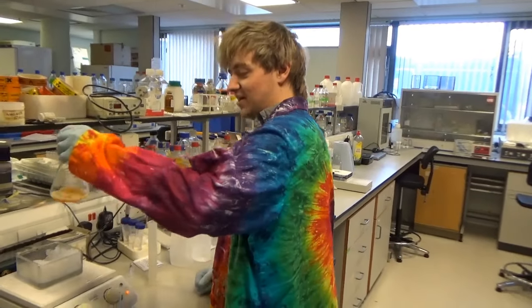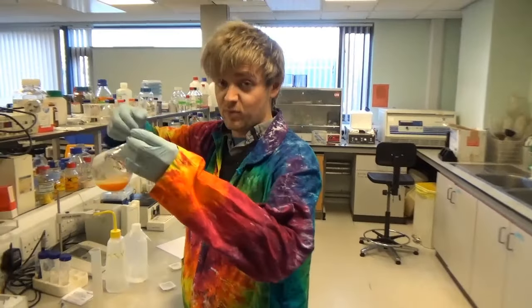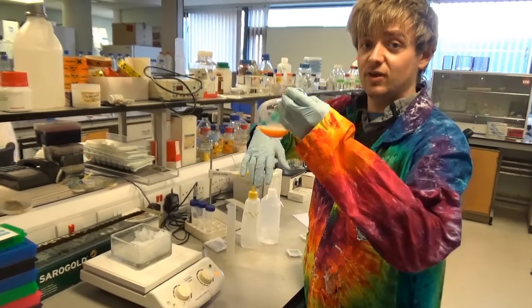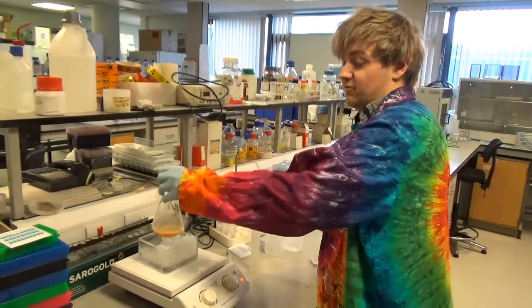All I do with this is I simply attach it with a pipette, same on my electrodes again, run an electric current through it, and that causes the molecules that are in here to stick to my electrode, and then with those molecules there I can then attach the DNA to that directly.